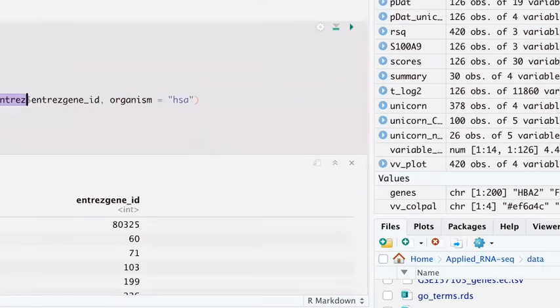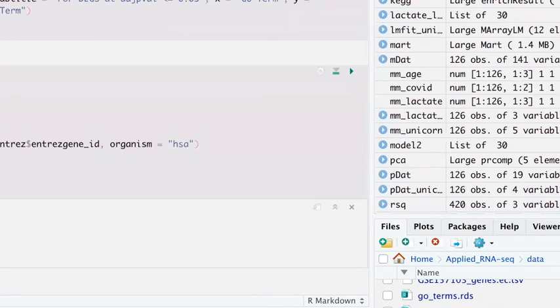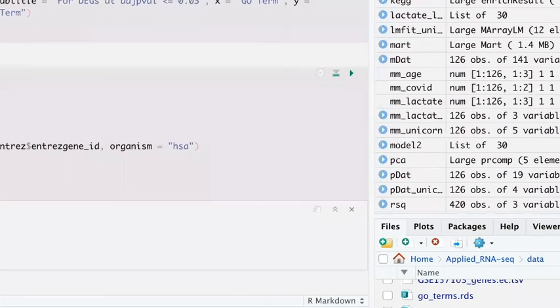So that's what we're going to do. We use the function called enrichKEGG. The gene is our HGNC to Entrez ID data frame, but our actual Entrez IDs, and our organism as human, Homo sapiens. And when I do that, again, when you're submitting these queries, try to put in as minimal as possible because it does take a lot of computation to run. Yeah, it might hang sometimes.